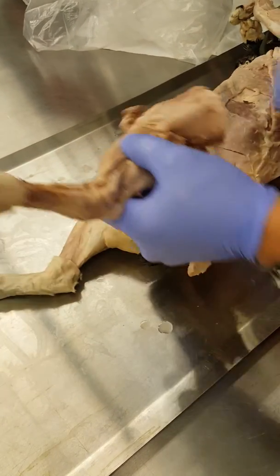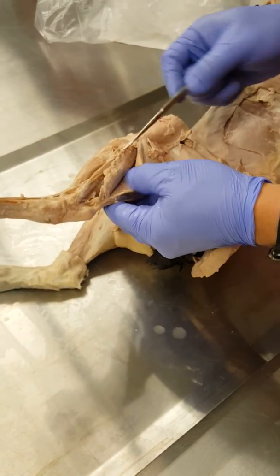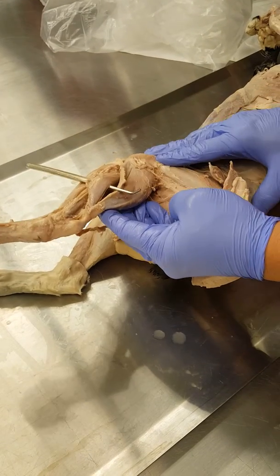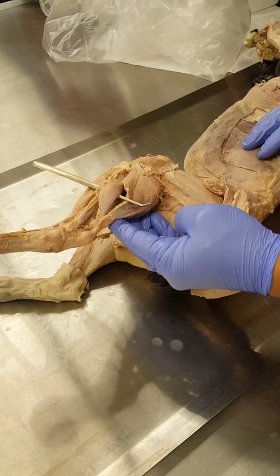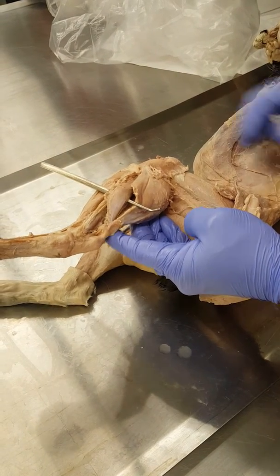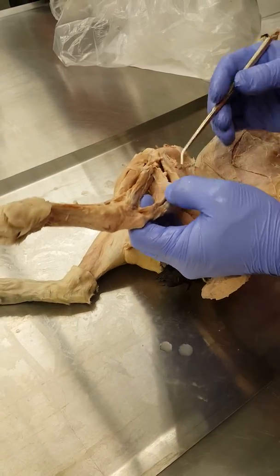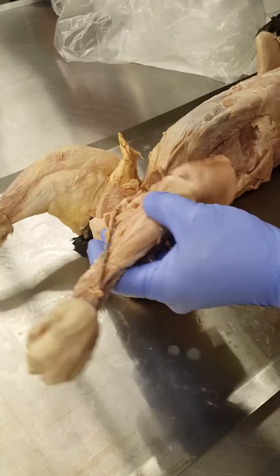Now when we look just deep to the lateral head of gastrocnemius, there's another muscle here, and this is the soleus. So lateral head of gastrocnemius, and then soleus is underneath it. Okay? Now there is another muscle here that is more of a cat muscle than a human muscle, but you can see it really clearly.